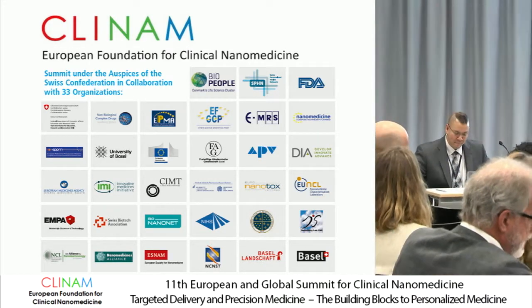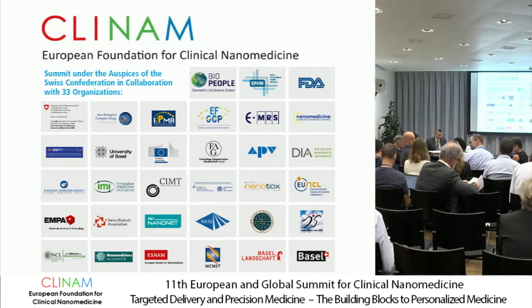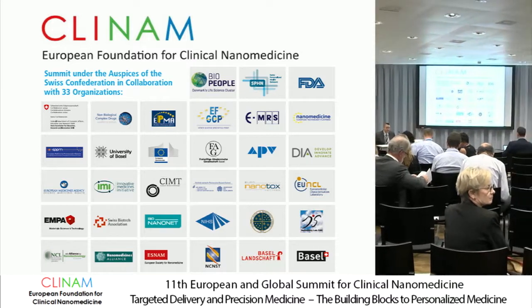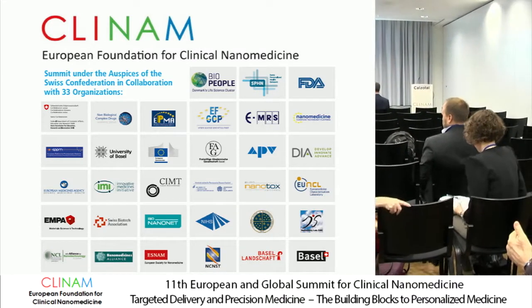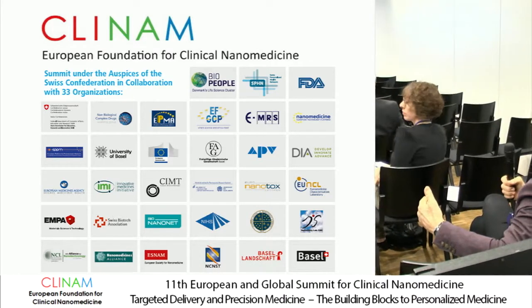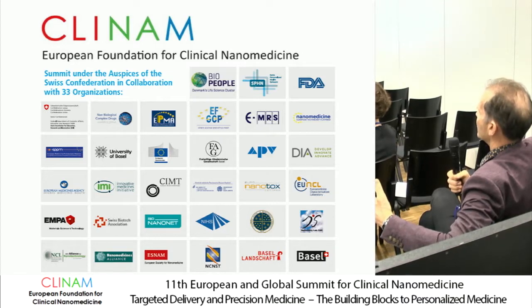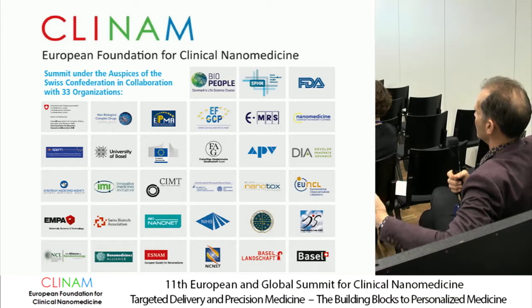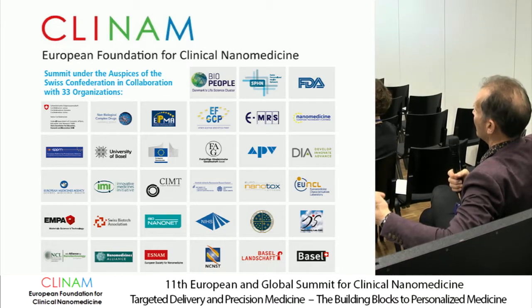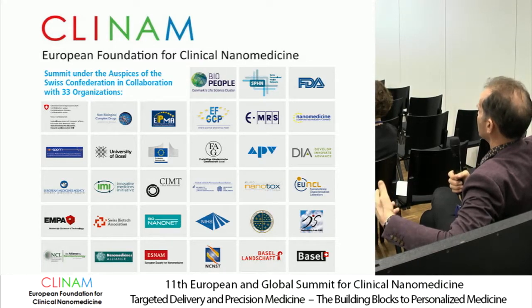I think the simplification where you have a Z average and a PI, we're going to hear that now in a talk, it's time to leave and go somewhere else, because it just shows to me the person does not know what they're doing. So it's just a total oversimplification. And the correct way to show size distribution is a 2D chart of number versus size. And then you get the number, and it's not one number for concentration, because that doesn't work either. And you should just put up a proper 2D histogram. And it's quite simple to achieve.